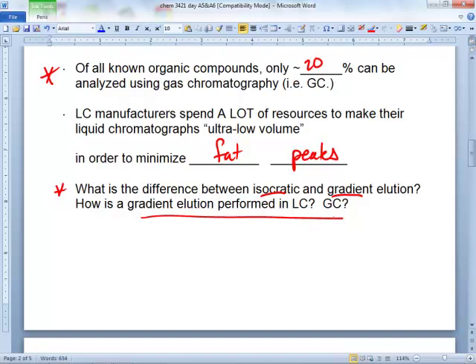So what do you mess with in an LC to move these little peaks around? And what do you have to control? Mobile phase. More specifically, the mobile phase, what makes it up? What's the technical word? Starts with a C. The mobile phase. Go ahead, composition, right? Constitution, same thing. The mobile phase composition. What makes up the mobile phase? That's what you have to control over here. What do you have control over with the GC?